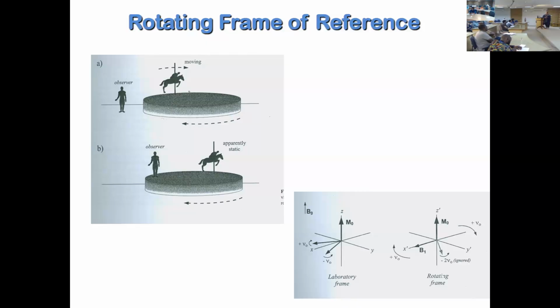But you cannot observe this when you are standing outside. As a matter of fact, sir, please correct me if I'm wrong, your observer, your detector, is also moving with this speed. That is why the detector can observe the speed of each proton.